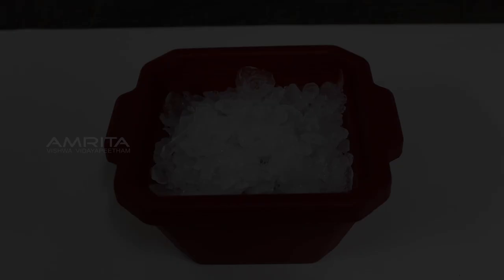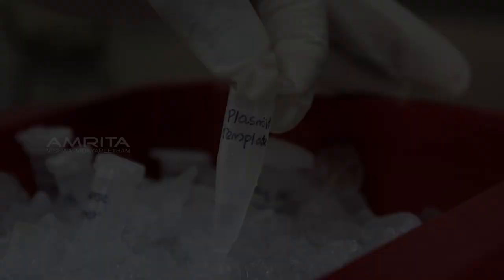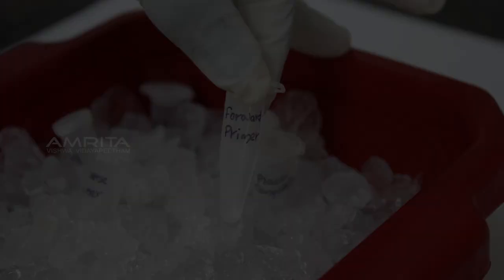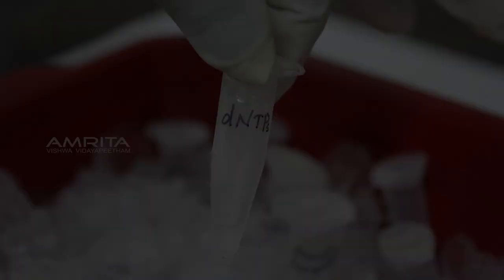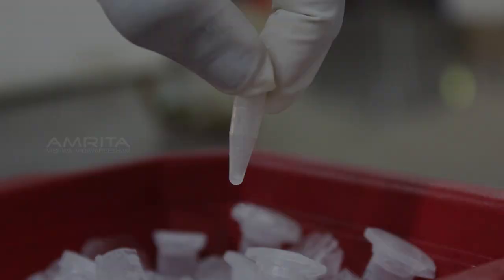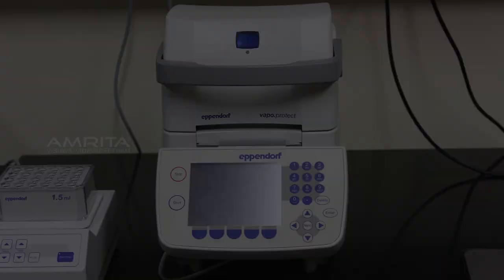Materials required: icebox, RNase-free DNase-free distilled water, 10x buffer, plasmid template, forward primer, reverse primer, dNTPs, Taq polymerase, PCR tube, micro pipettes, pipette tips, and thermocycler.